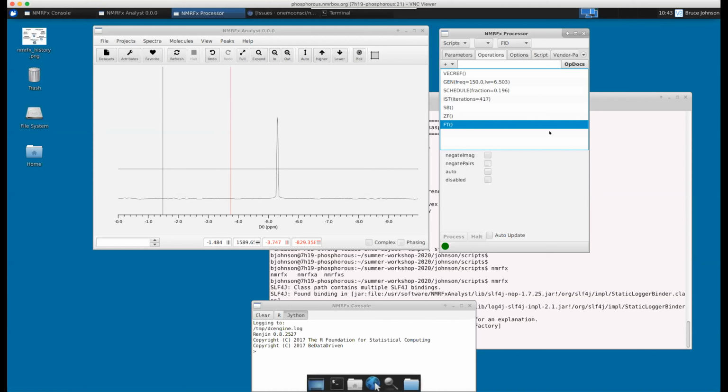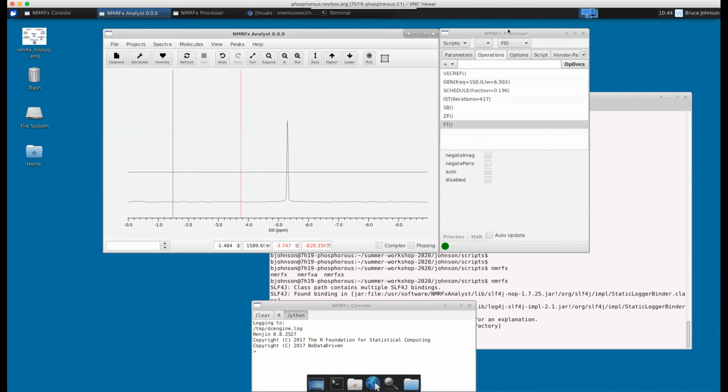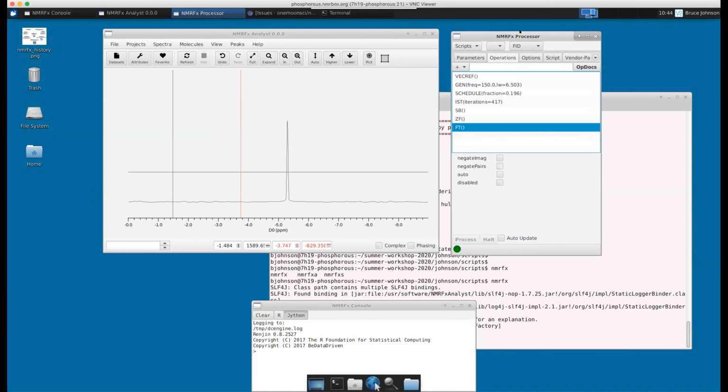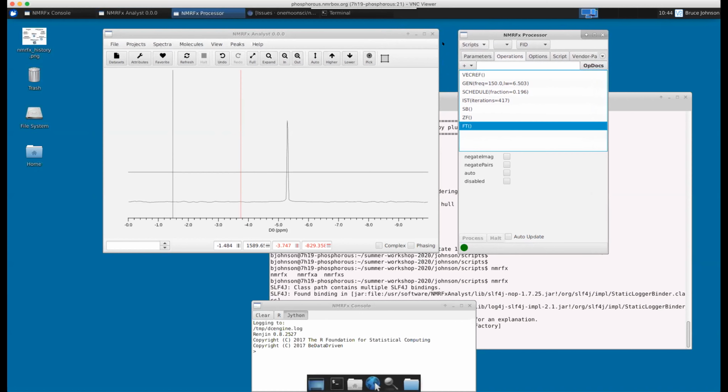Right. So that's why with 1D and a small number of points, it's really fast. And the trick is making that really efficient as you go forward. So Bruce is exactly right, and what he's showing you here is really quite well optimized. We've got pretty good performance, and we'll show you on real 3D data, running things in parallel. A big push for this year is to move into the world of GPUs, which are really optimized for doing these FTs. So that's one of our goals. So let's just wrap up, Bruce, sorry.